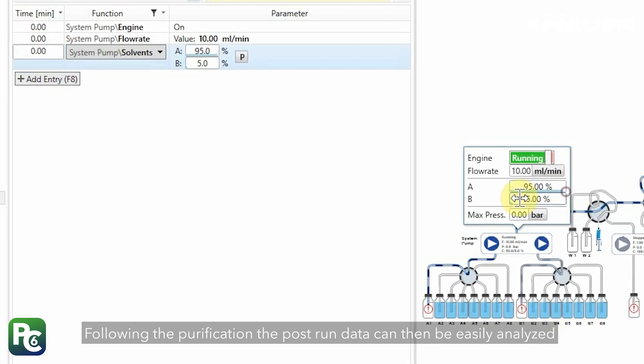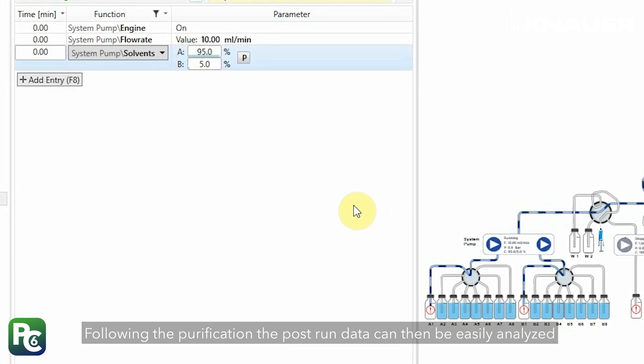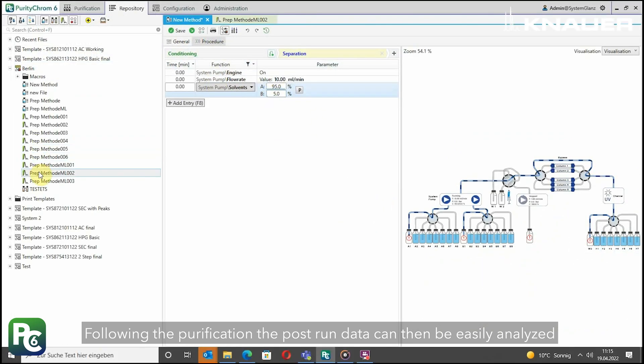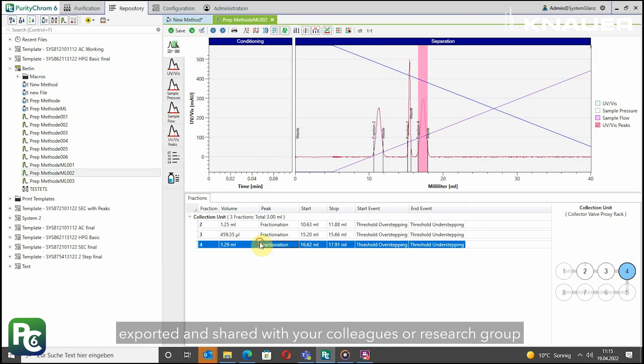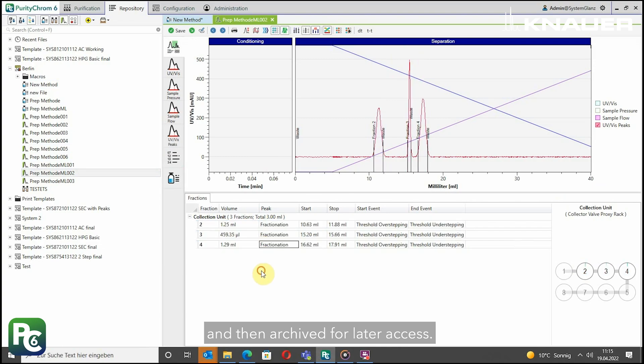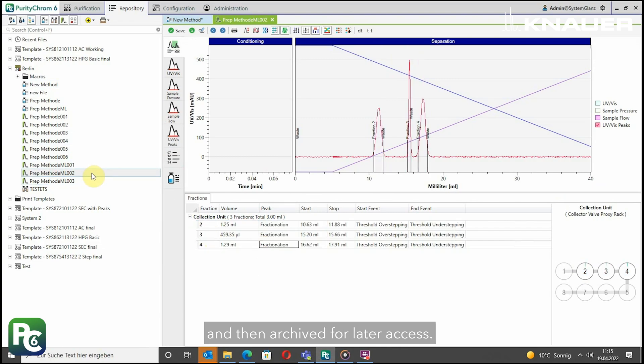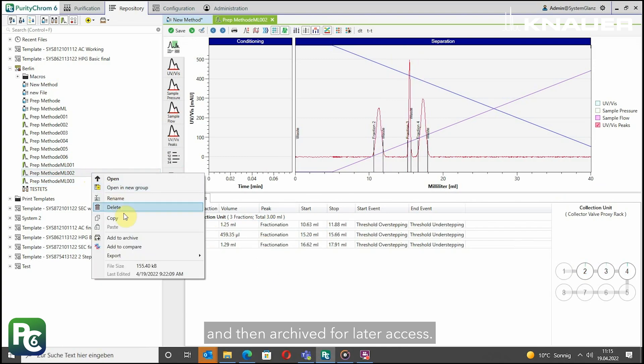Following the purification, the post-run data can then be easily analyzed, exported and shared with your colleagues or research group and then archived for later access.